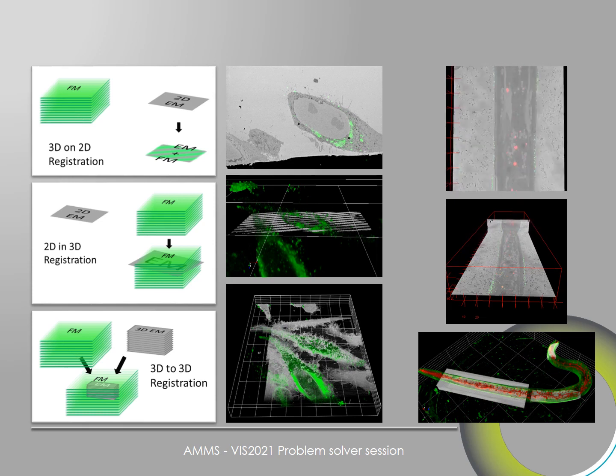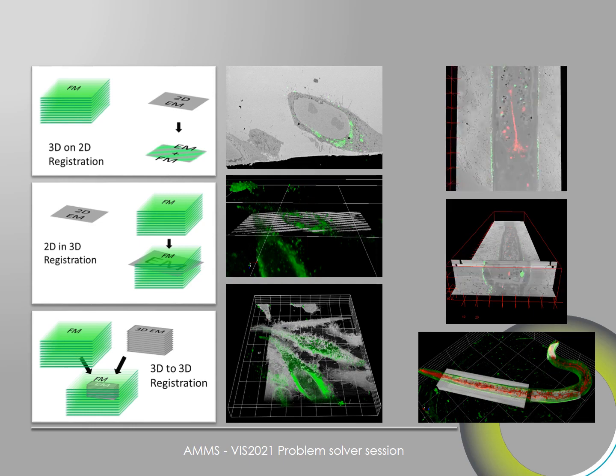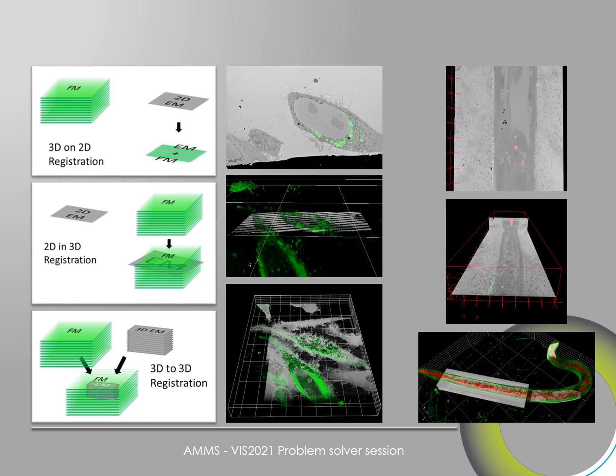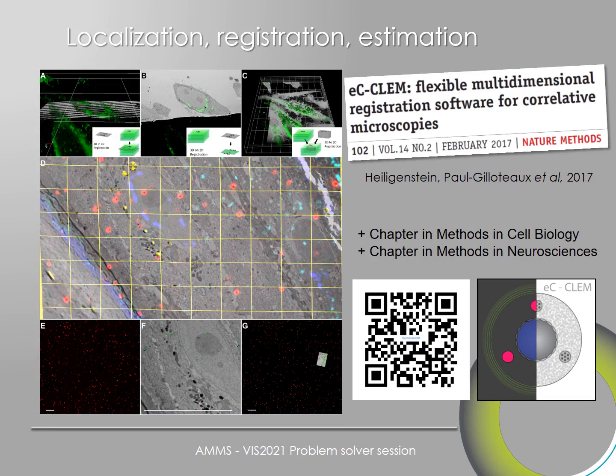And if you have a computer which is powerful enough, you can do it. If you have a smaller computer, you can also calculate that on a binned dataset and apply the binned transformation to the unbinned dataset. I'll point that out in a second.